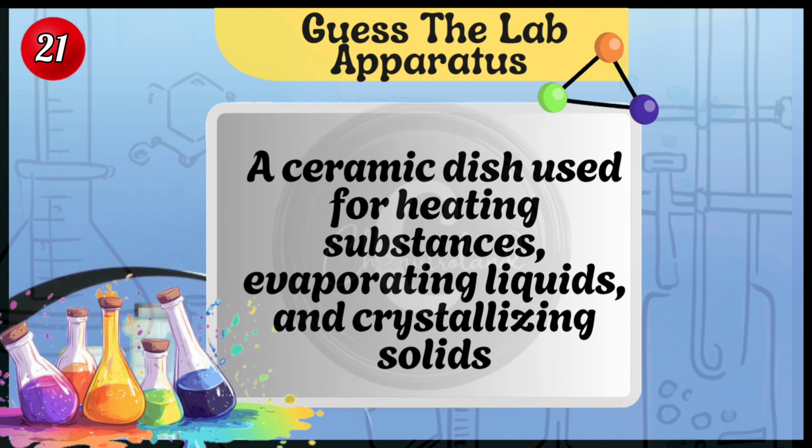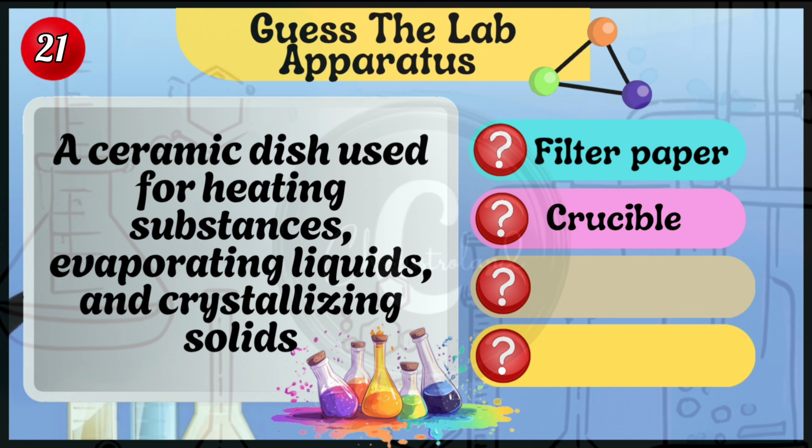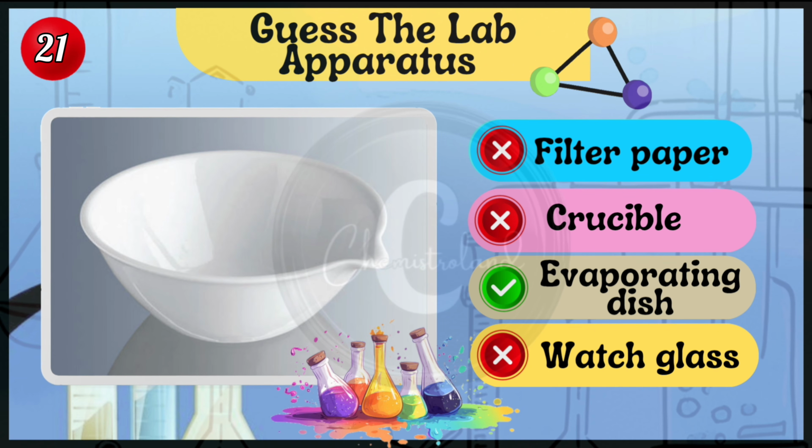A ceramic dish used for heating substances, evaporating liquids, and crystallizing solids. Filter paper, crucible, evaporating dish, and watch glass. Evaporating dish.